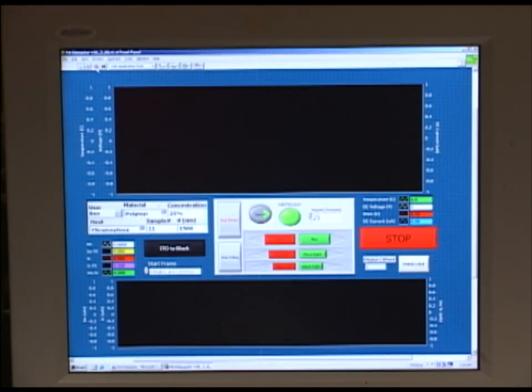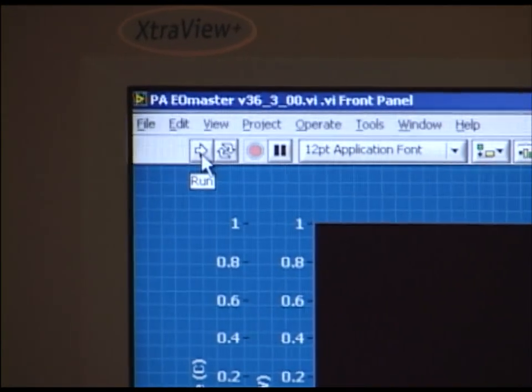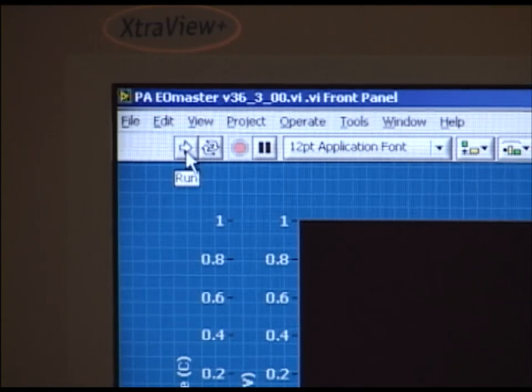After the information is entered we can click the run button, which is a forward-pointing arrow up here in the left-hand corner, and this will begin the poling process.